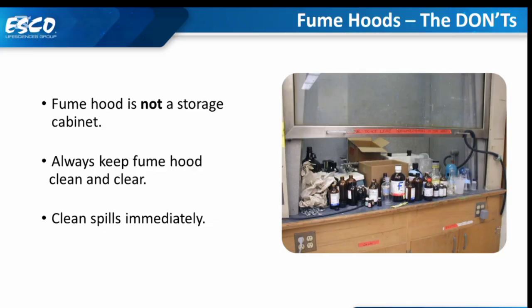Okay, here are some don'ts. We should never use a fume hood as a storage cabinet. I think I've been saying this. A fume hood is not a storage cabinet. Always keep the fume hood clean and cleared. Clean spills immediately as they happen.